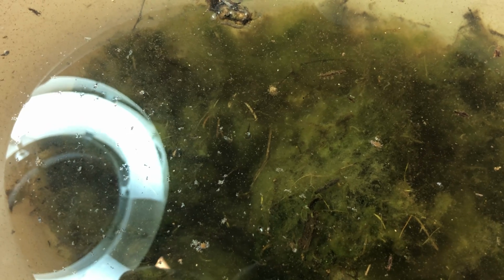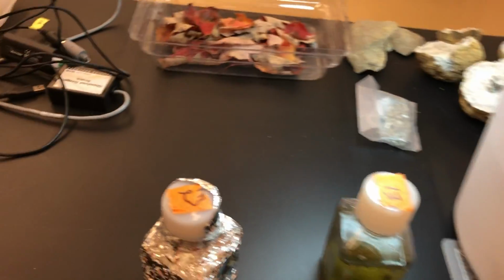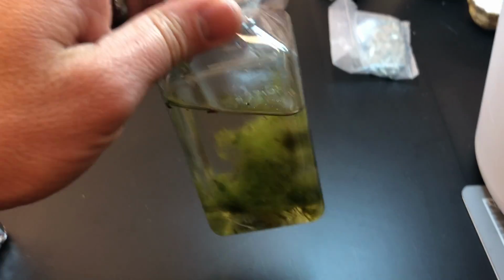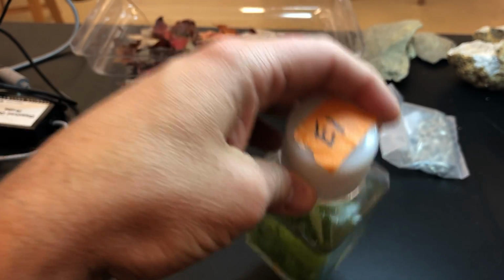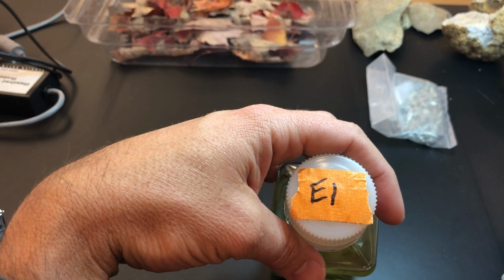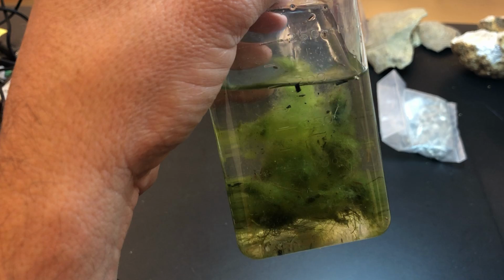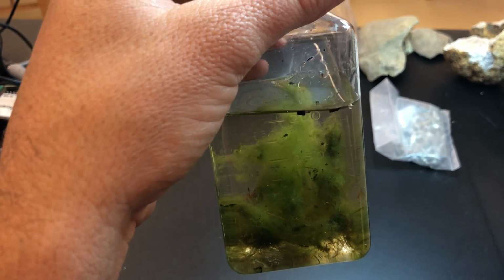So I'm going to try to prepare some microscope slides to accompany this here. But really what we're focused on is the algae. So I've already prepared, and I just want to show, I set up two containers that were identical to one another. This is container number 1, and I called this E1 because I was collecting this as a focus for my E section. I created some for my A section as well that are already set up in the windowsill. But this has 250 milliliters of water and 10 grams of wet algae. So they should be exactly the same.